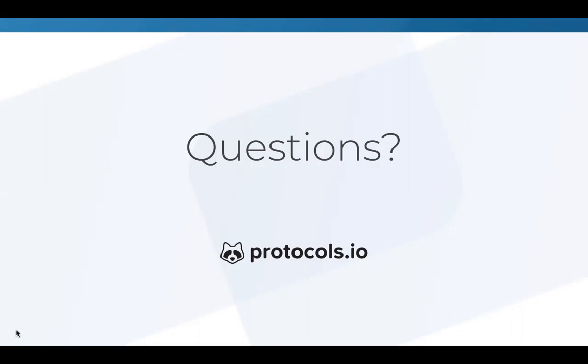And yeah, so you can put whoever is the author, if you know who the author is, and you can put yourself as the contact person. And if one day somebody wants to take over that protocol, you can always transfer the ownership. But the author field, once it's published, cannot be modified, but the contact person can always change. And if you have a protocol that's been lying around in your lab forever and just kind of came out of the lab, you could put the lab name, for example, as the author, because maybe you don't know who exactly developed it.